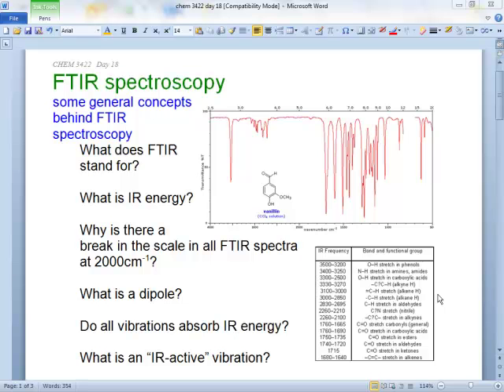It's really nice for functional groups there. Yeah, just if you want to know if a functional group is there or not. But can you think of... You've touched on pretty much every machine upstairs, but you can imagine what the HPLC will do. But is there something that this machine can do that the others can't? I'm just kind of thinking aloud.